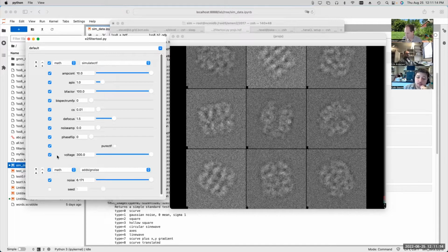Most people would look at the image and say, well, there are two ways of looking at it. One way is, there's this noise generated by the imaging process itself. So there's so-called shot noise, which has to do with the fact that you're broadcasting a finite number of electrons, and when you count the electrons, there's inherent uncertainty in that counting process, and that produces so-called shot noise.